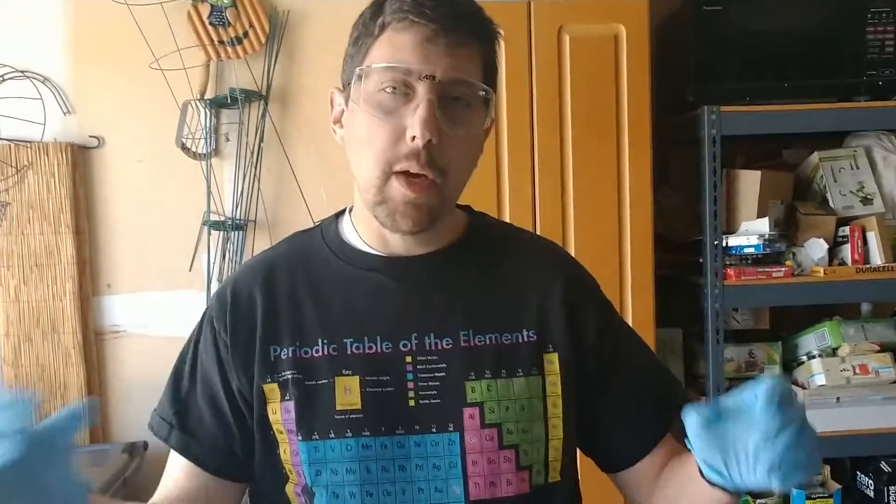Good afternoon. Welcome to another installment of Garage Chemistry. We're continuing with our experiments on the chemistry of spies, and today we have some quote-unquote magic paper.